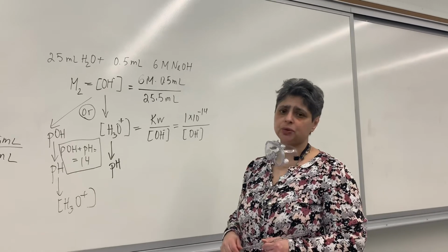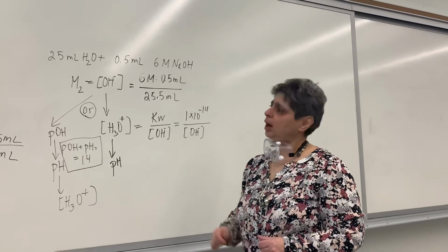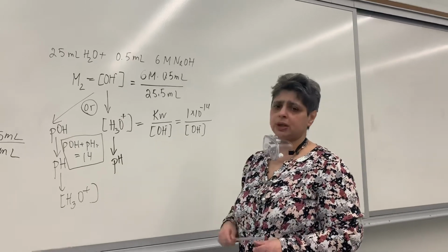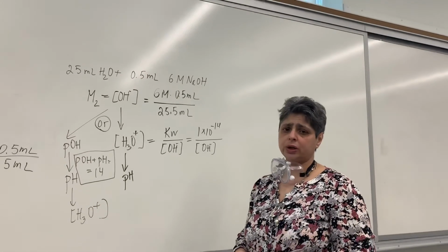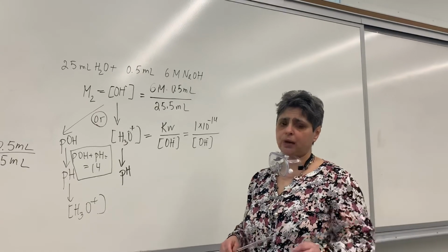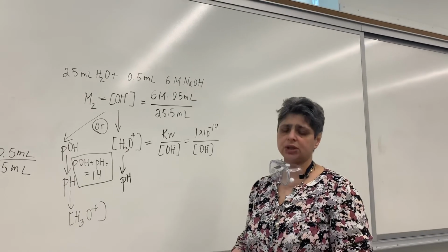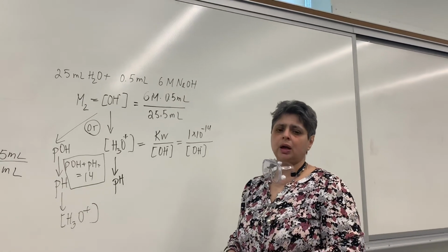I hope this helps you with filling out your data sheet. When working on the data sheet with pHs of water and the buffer, my recommendation is to do them separately. Do all the buffer beakers first and then do all the water beakers, because the calculations are so different. That's all.